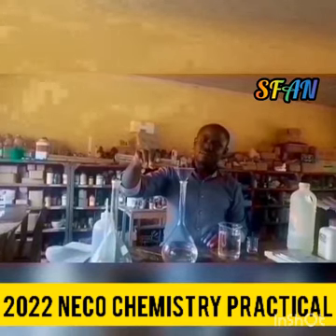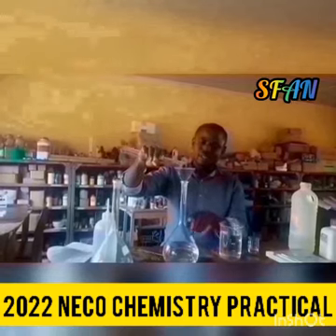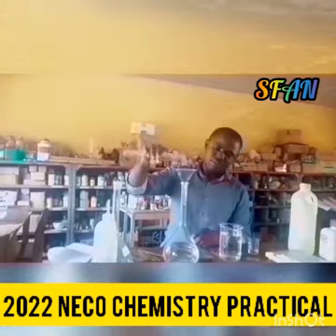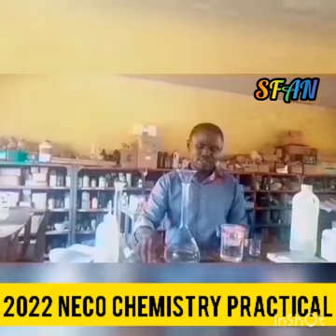And I will top it up to the 1000 cm³ mark with distilled water.